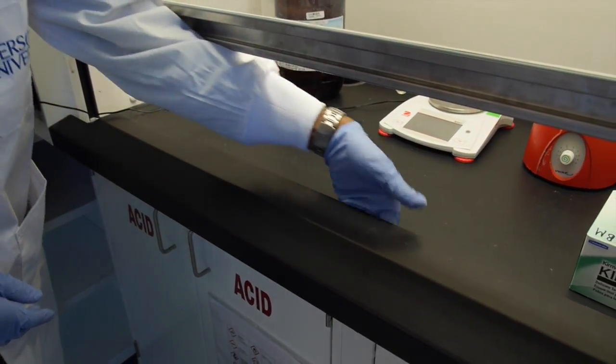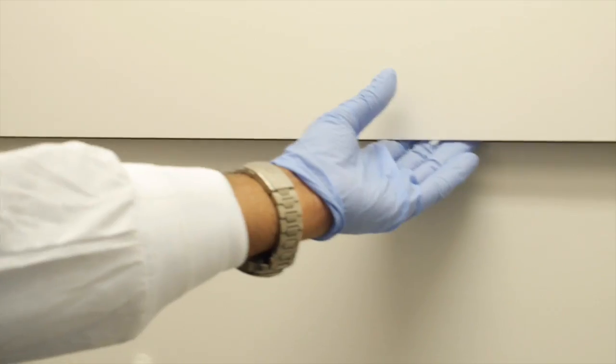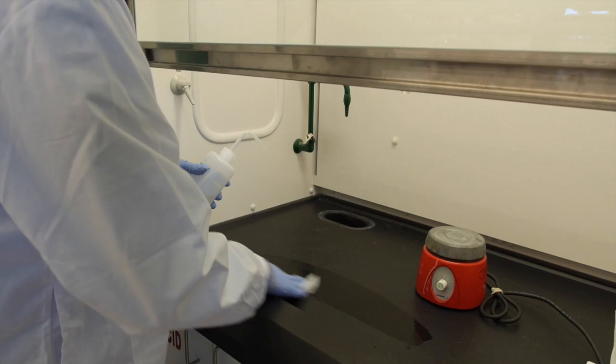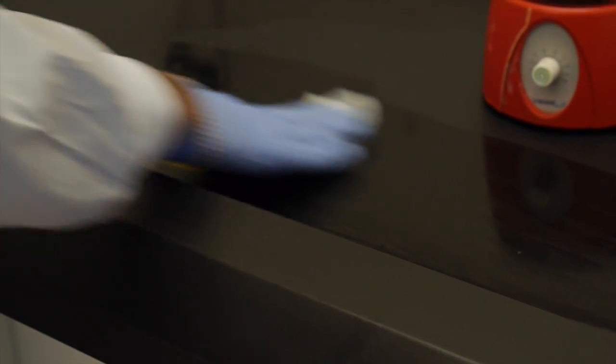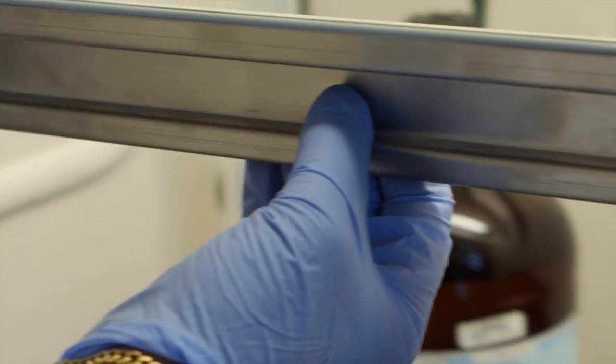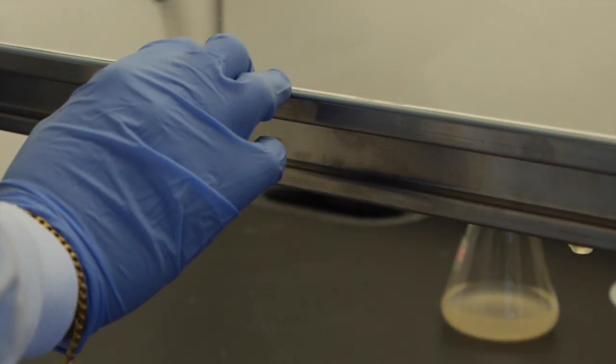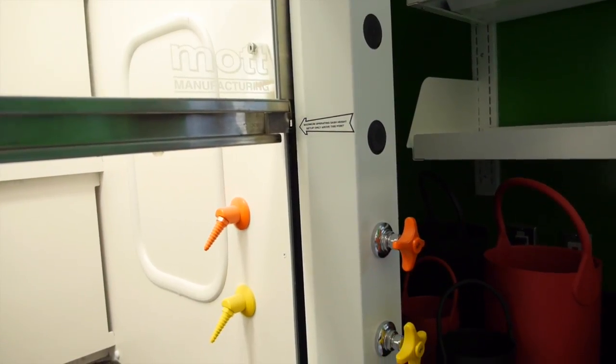Daily maintenance should be conducted by fume hood users before each use. Ensure that the work surface, baffles, and airfoil are clean and free of obstructions. It's important to inspect the sash mechanism for any corrosion, damage, broken glass, and to ensure that it's operable. The operation should be smooth and easy throughout the sash's travel.